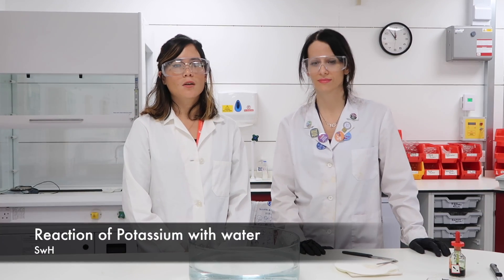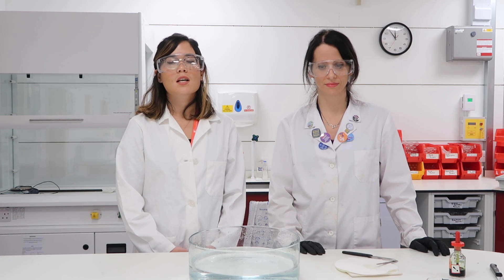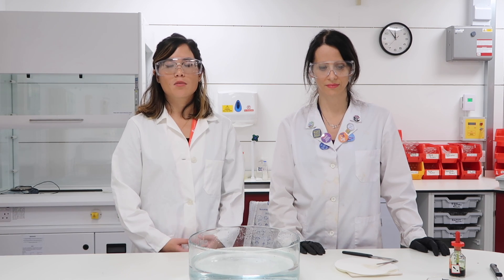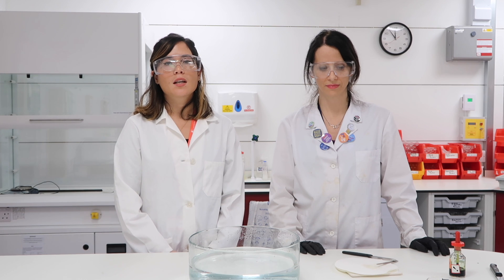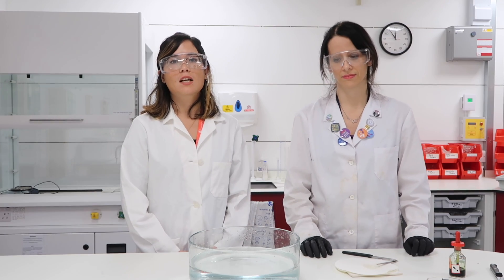In this third video, Emilia and I are going to continue our examination of group 1 metals, this time looking at the reaction of potassium with water. Now potassium is more reactive than both lithium and sodium, so you will expect a more vigorous reaction.